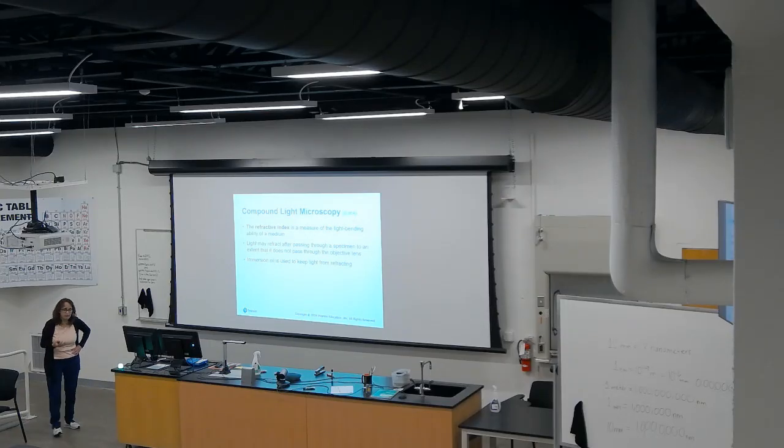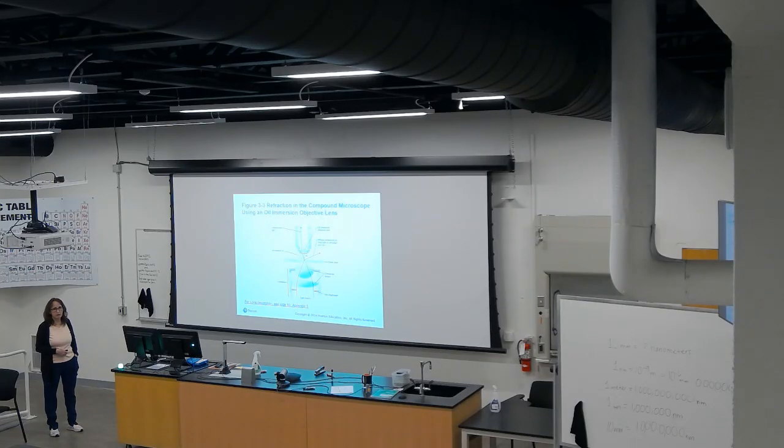Anytime that a wave of light passes through a physical object, that light is going to tend to refract or bend away. So when you lose light as it's passing through this objective lens, you lose resolution. So you increase resolution by adding some medium.